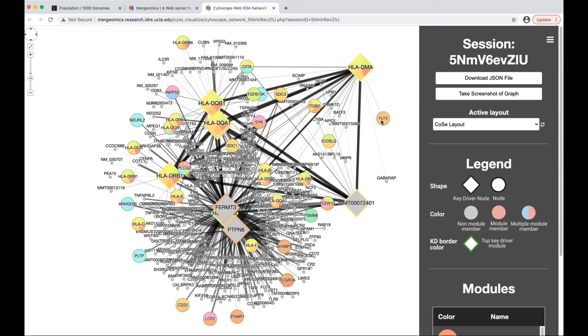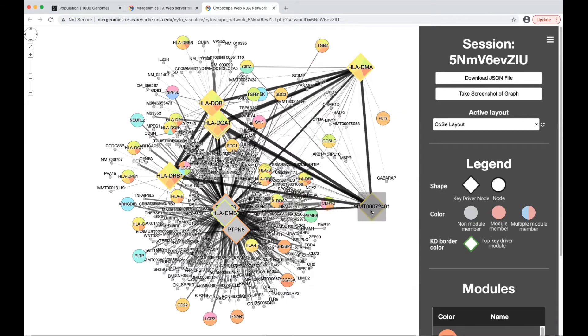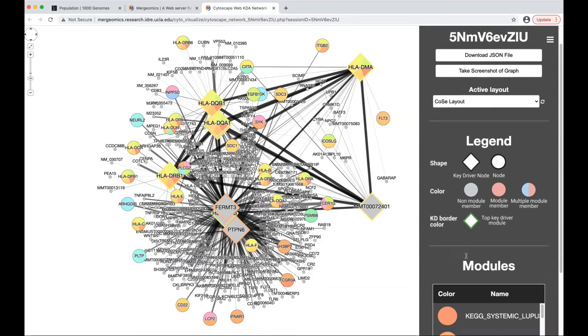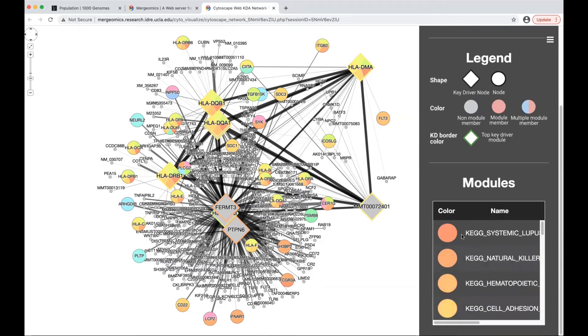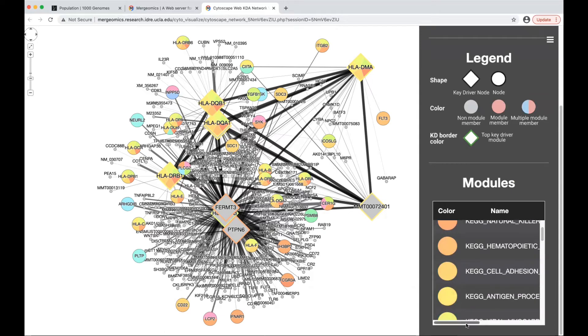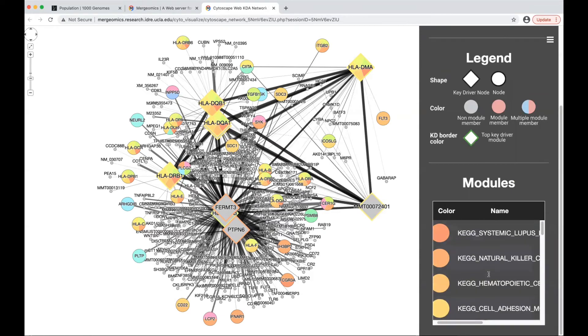If it's part of multiple modules, then it will be multicolored. The key driver border color signifies the module that the key driver is the top key driver of. The colors represent the pathways that they are associated with.